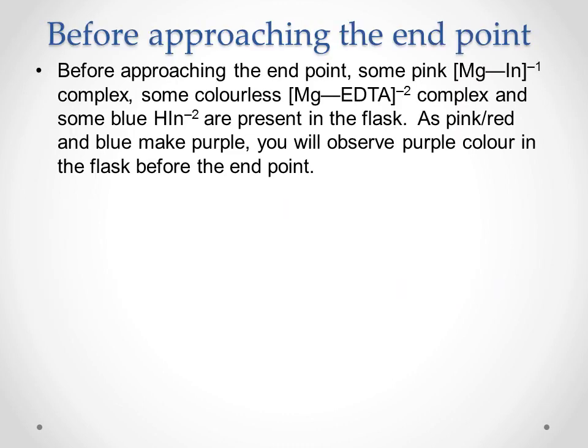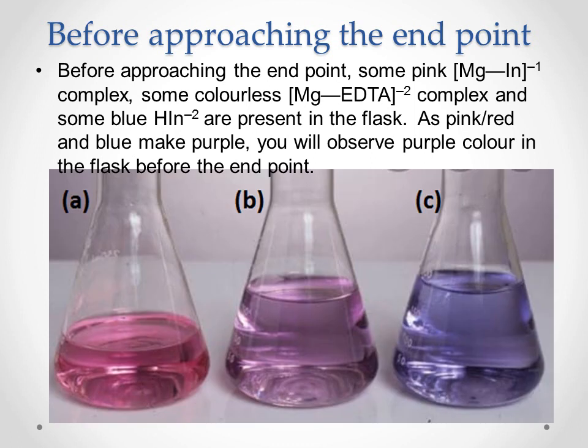Now, what will happen? Before approaching the endpoint, you will have this purple color, as you can see in the picture below. In the conical flask A, you can see the red pink colored magnesium indicator complex. After the addition of EDTA, magnesium indicator complex is breaking, magnesium EDTA is forming, that is colorless, and side by side there is the formation of free indicator.